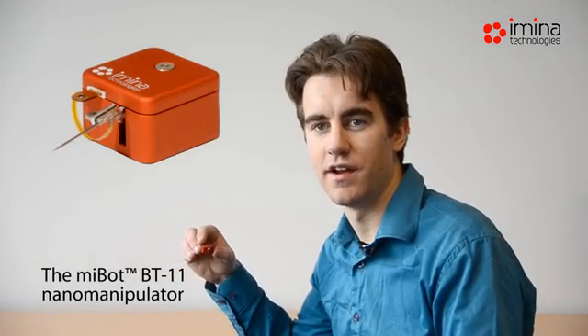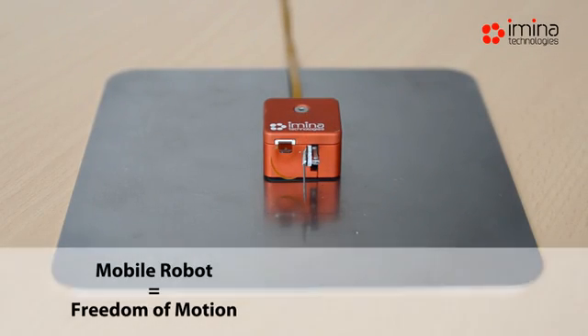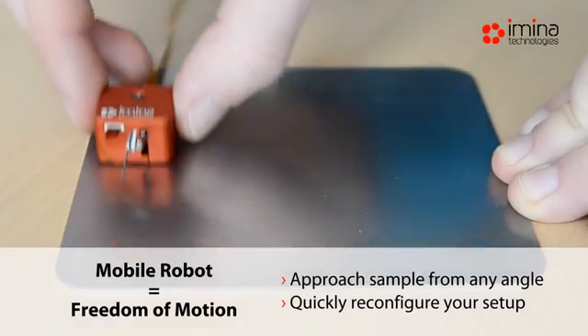The MyBot Nano Manipulator is the flagship component of the solution. Contrary to a traditional manipulator, the MyBot is a mini mobile robot. It is virtually untethered and free to move about the stage.